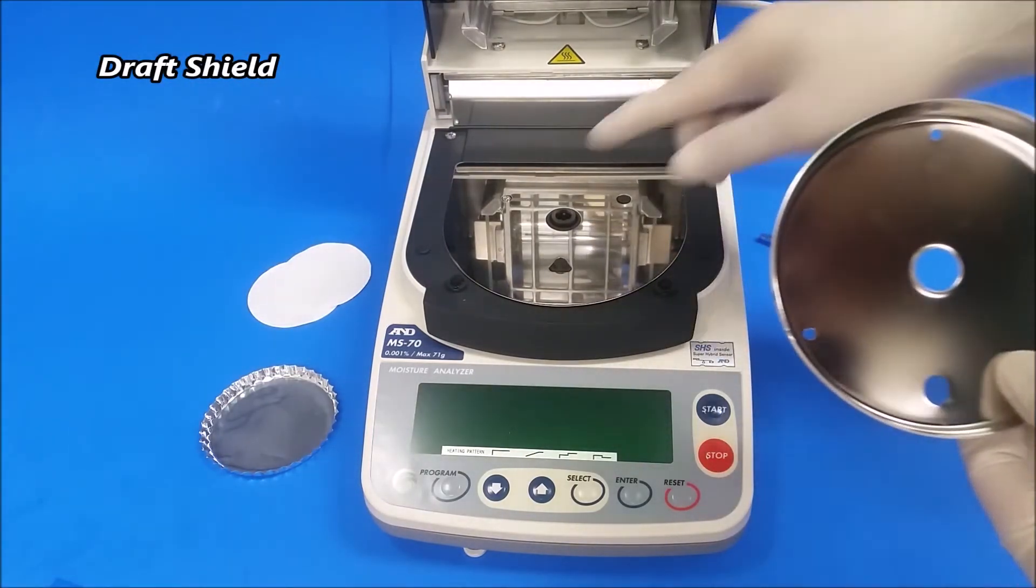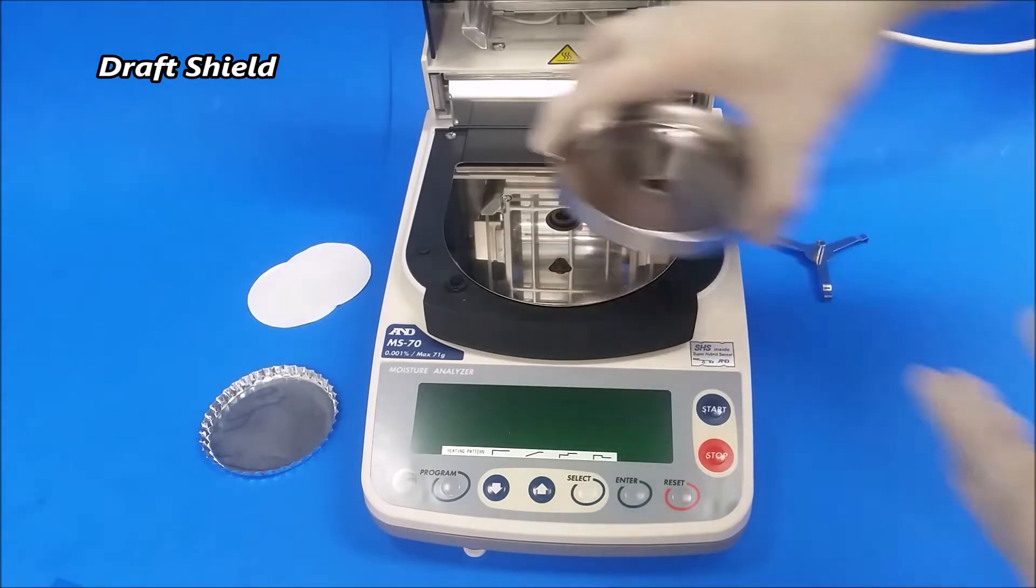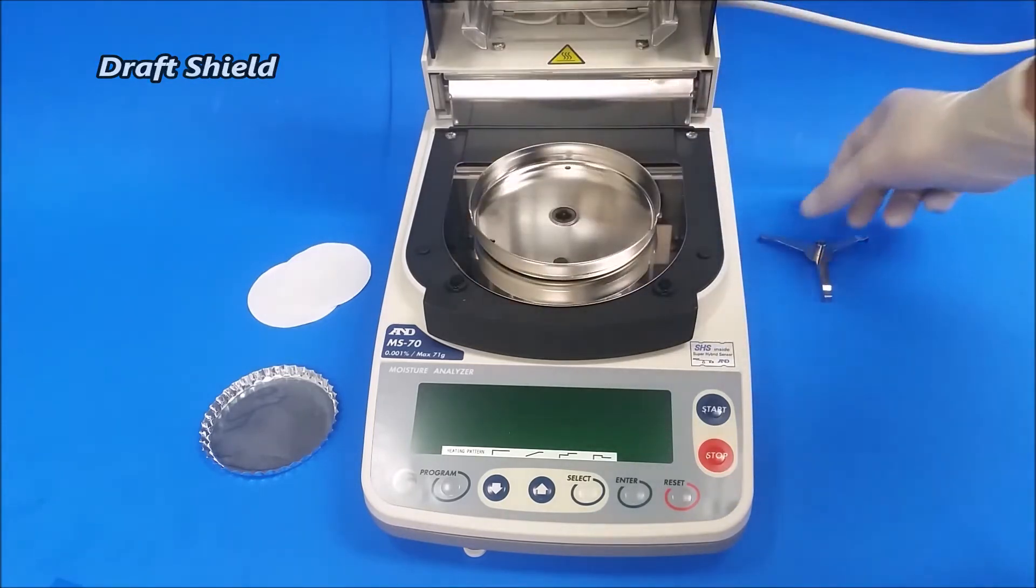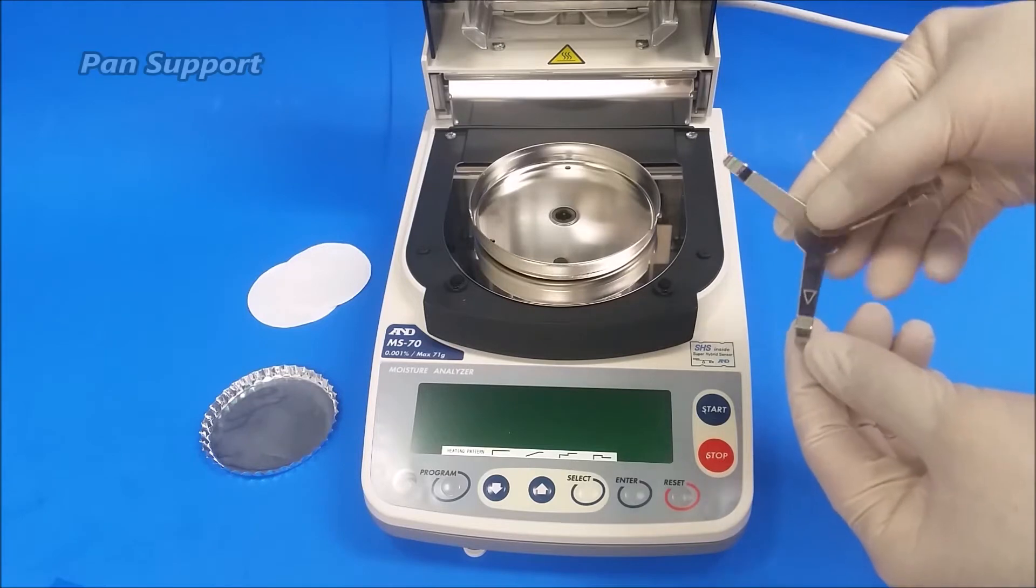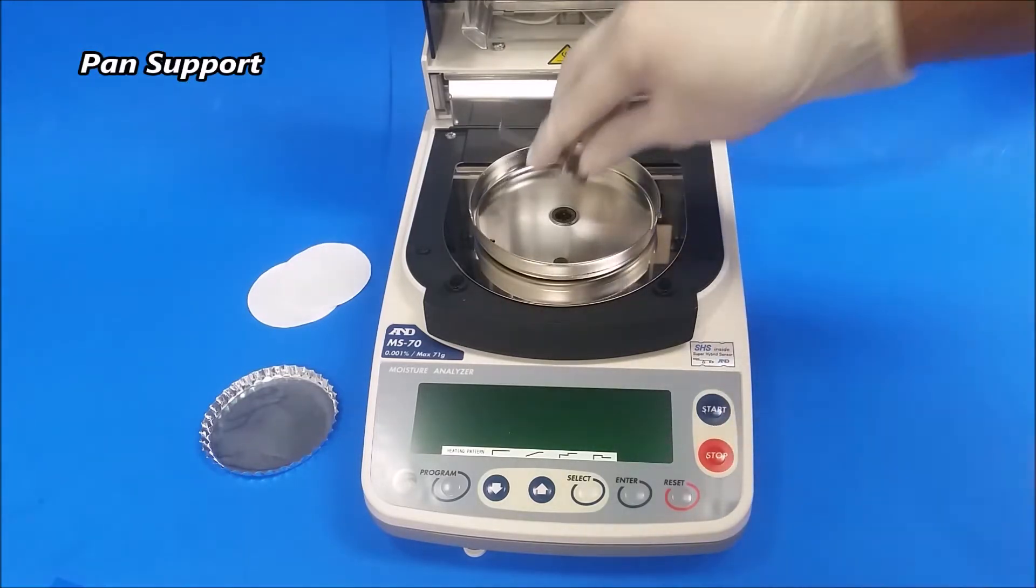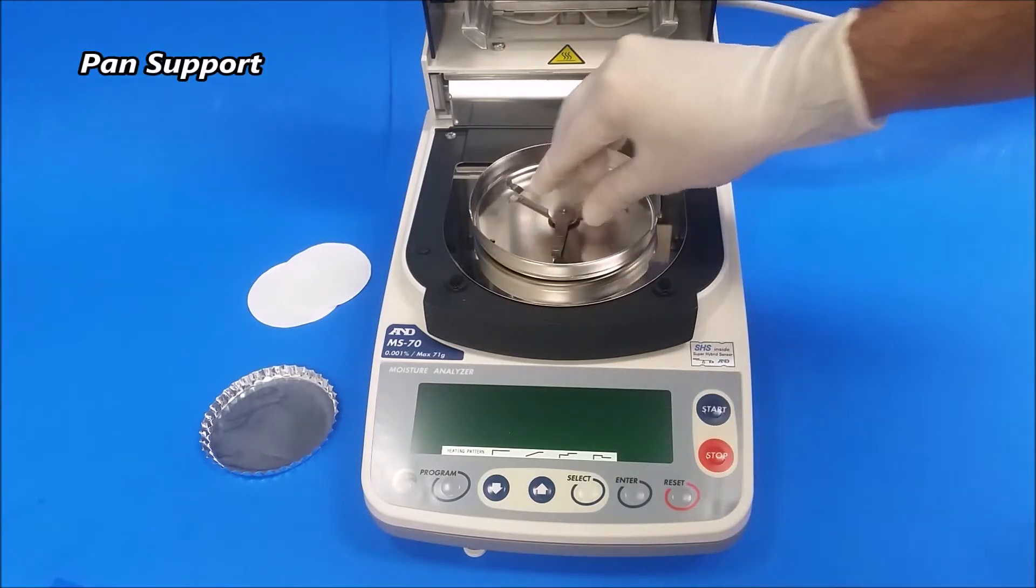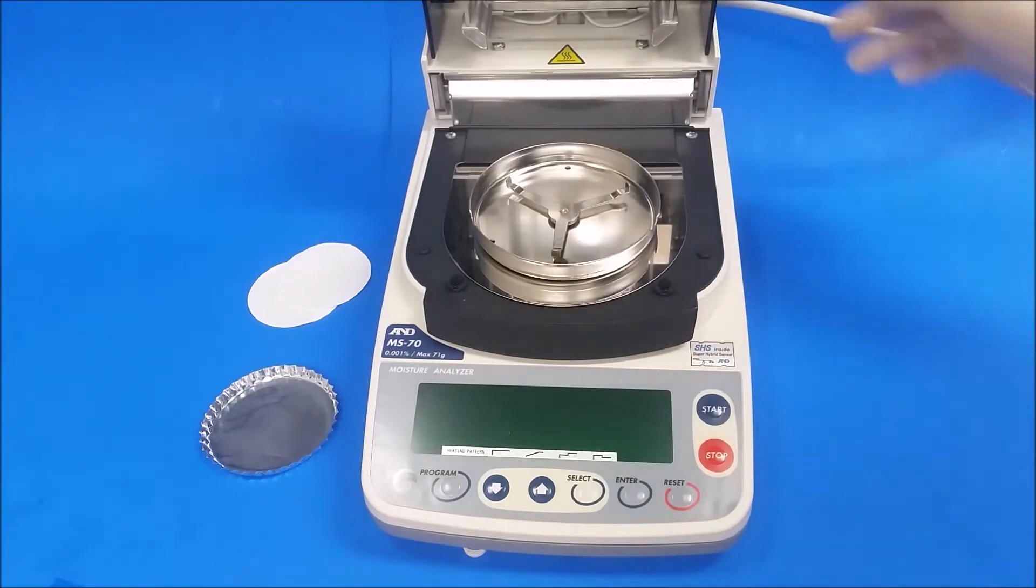Next piece will be the pan support. There's a little arrow that should be pointing towards you. Next will be to plug in your unit. On the side here there's an on and off switch.